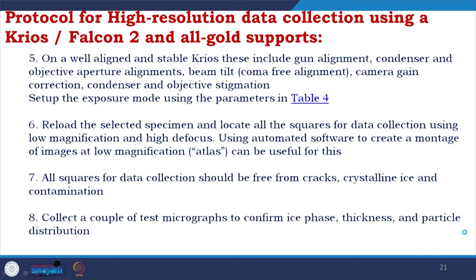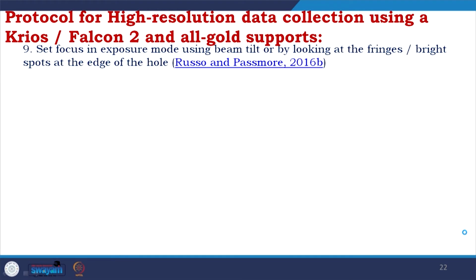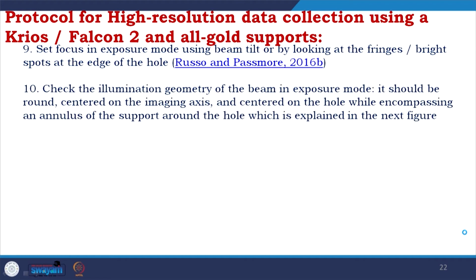Collect a couple of test micrographs to confirm ice phase, thickness and particle distribution. Set focus in exposure mode using beam tilt or by looking at the fringes or bright spot at the edge of the hole.